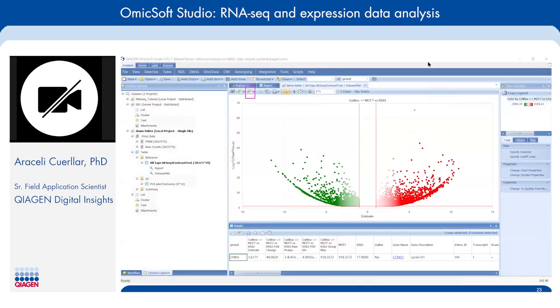Excellent. Another question that came up was somebody was wondering if this DESeq2 one-way test that you chose, is that the same as DESeq2 Wald T test? I am not familiar if it is or not.